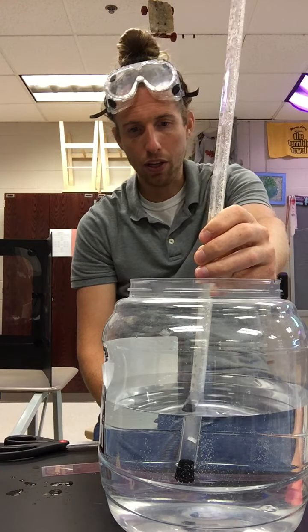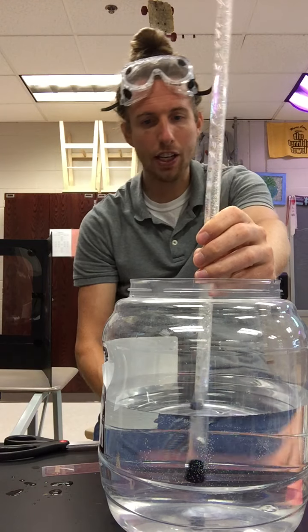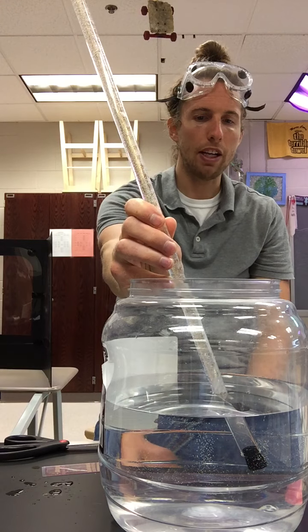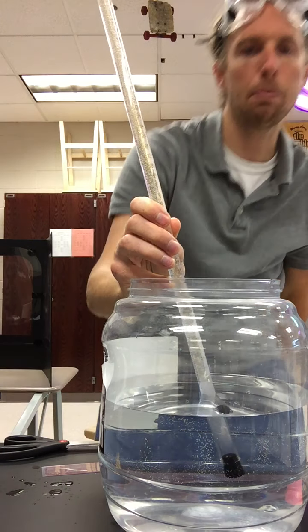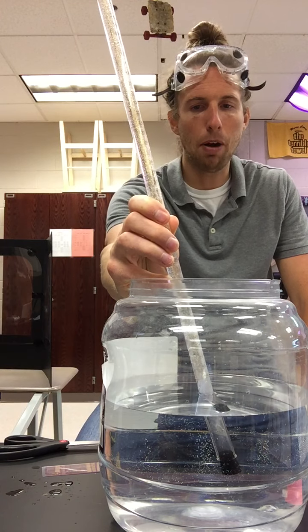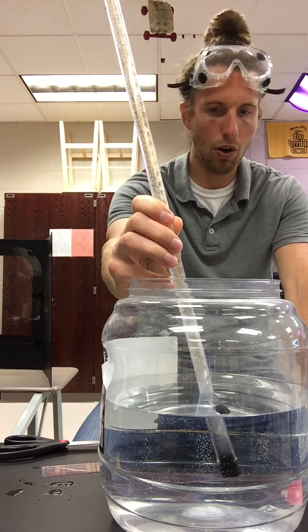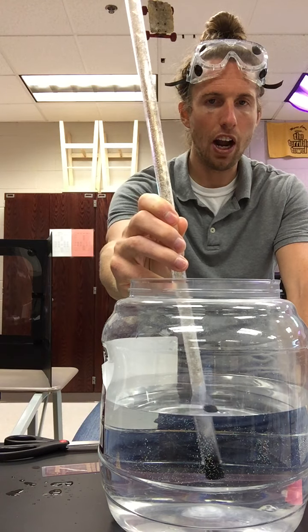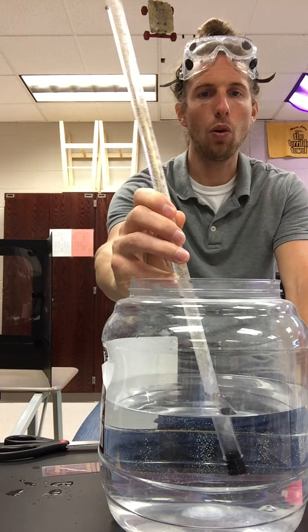We're going to continue this reaction until all of this magnesium is consumed. As I mentioned before, the magnesium is my limiting reactant, so we expect that entire piece of magnesium to disappear. It is getting a little bit smaller as I watch, and you can see the bubbles are becoming a bit more vigorous. So every second that goes by, we're freeing up more and more surface area on that magnesium in order for it to react.